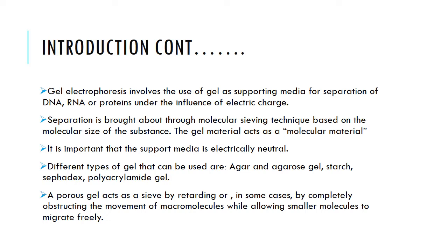So this gel acts as a molecular sieve. When we compare this gel to a sieve, we are saying it is supposed to be porous. It is supposed to have certain pores, and those pores will allow molecules to move under the influence of the electric field.